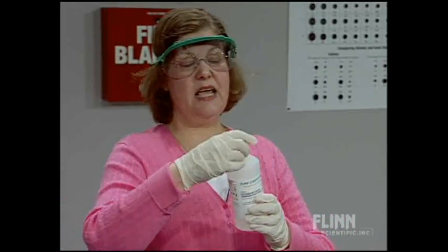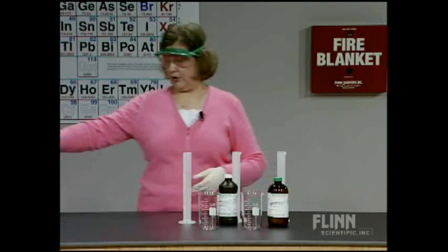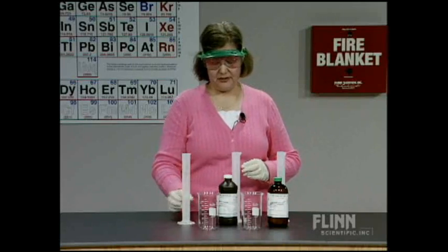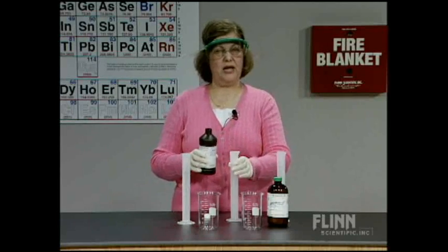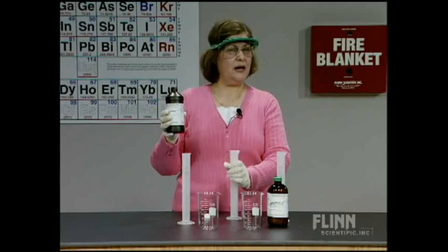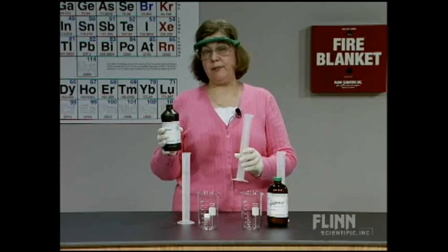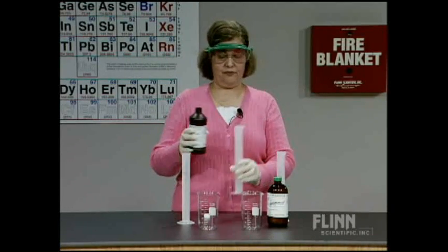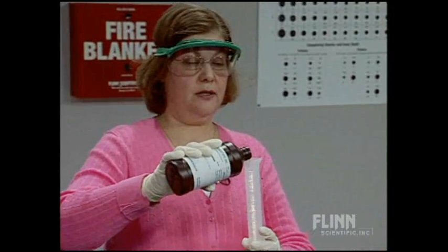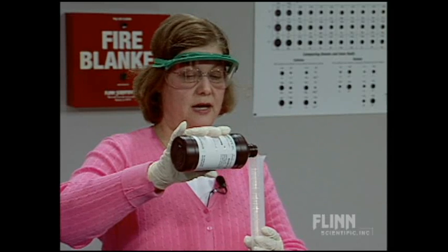My first solution is potassium iodate. And it is an acidified solution. It has a little bit of acid in it. That acid is important for the chemical reaction to take place at a good rate. My second reactant is going to be hydrogen peroxide. This is about 9%, a little bit less. And we've basically optimized the concentration for this reaction. And it is easy to remember in this one. The precise amounts are important, but you use equal amounts of all. So I had 80 milliliters of the first one. I want 80 milliliters of the second, and again, this is about 9% hydrogen peroxide.